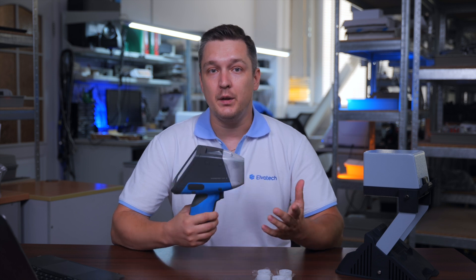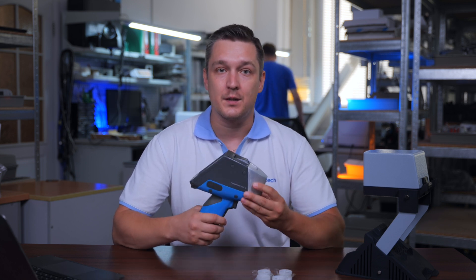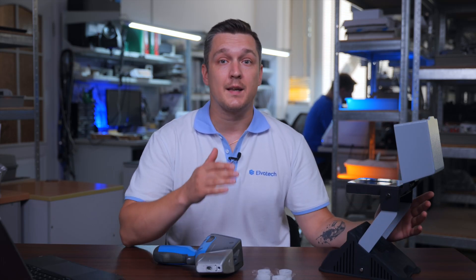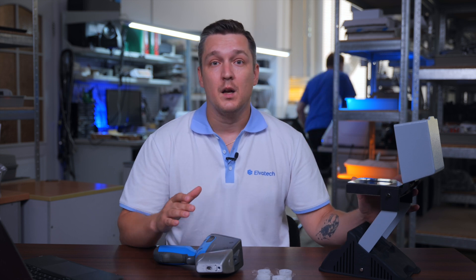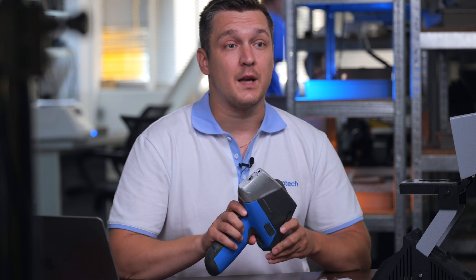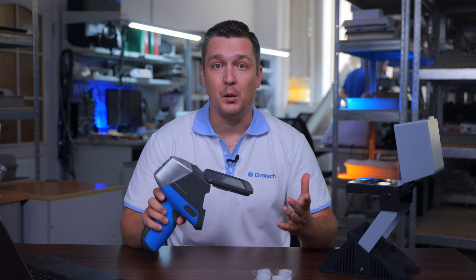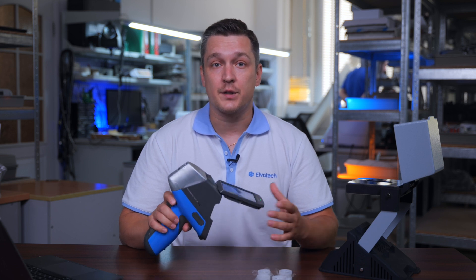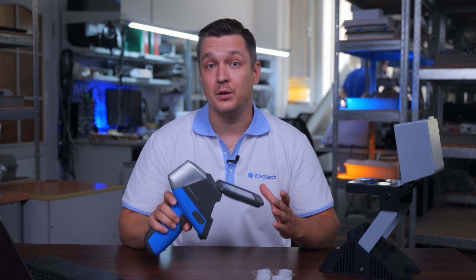High accuracy and speed are key advantages of this device. The lab stand allows you to analyze cement in sample cups anywhere it's needed. It can be easily assembled in just 30 seconds, making it very convenient for mobile applications and field work. Prospector 3 attaches to the stand easily, providing a stable measurement and ensuring accurate results even in challenging conditions.